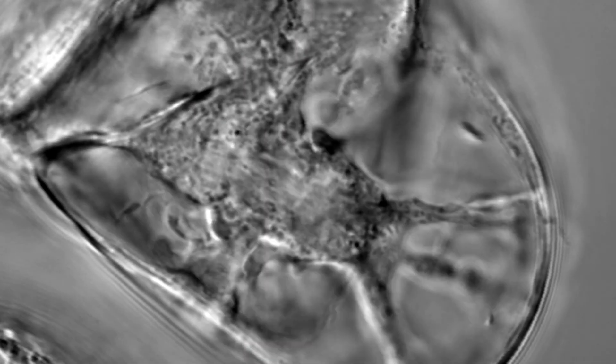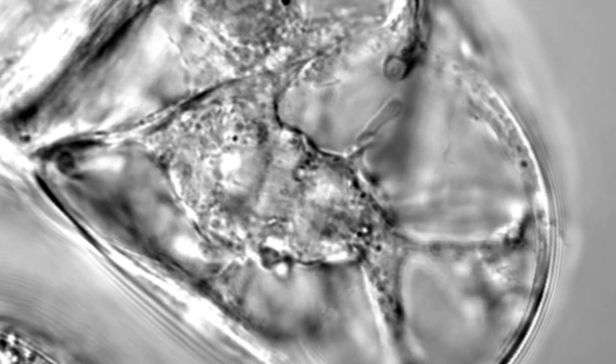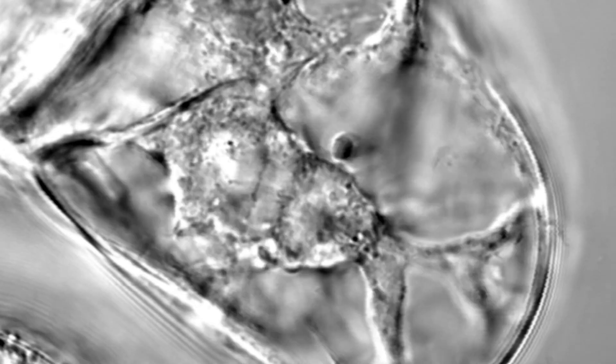Finally, we have a video produced by Rigoberto Ramirez and Ernie Kwok showing tobacco cells undergoing mitosis. The microscope is using strictly transmitted light with differential interference contrast.